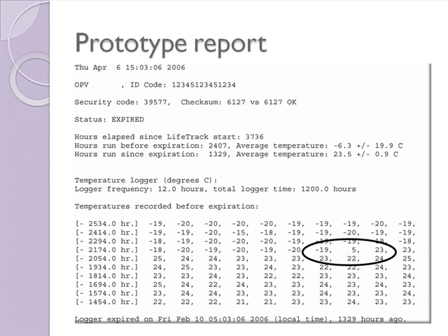What is happening is that in this example we have an example of an oral polio vaccine tag, and remember, oral polio vaccine should be frozen. And here we see a series of temperature readings taken every 12 hours, showing, okay, yes, it's been frozen at -20, everything's fine, everything's fine. And then suddenly, right in the circled area, we see something weird happened. It suddenly has gone from -20, freezing conditions, to, oops, somebody seems to have left it at room temperature for a long time.